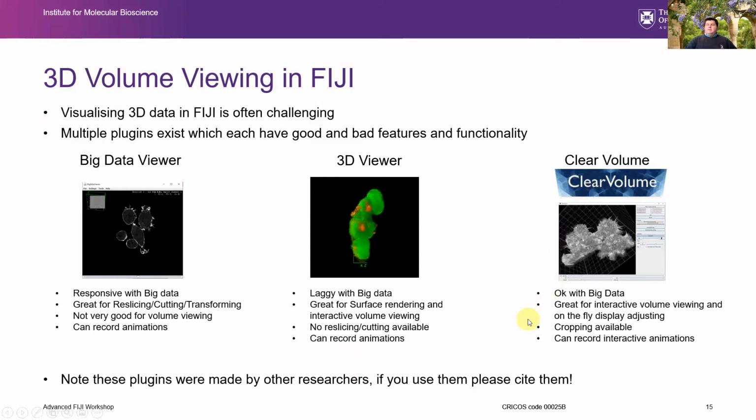Clear Volume is okay with big data. It's great for interactive volume viewing and on-the-fly display adjusting. It has some cropping available, and record interactive animations is possible.